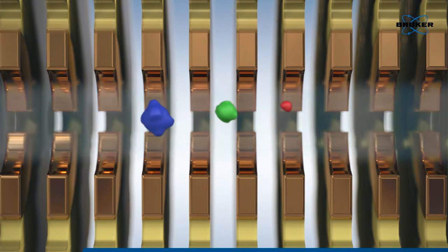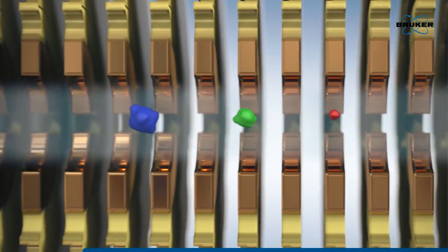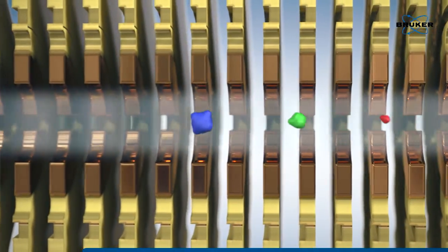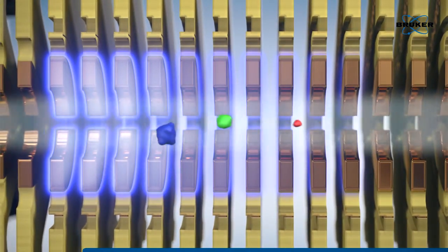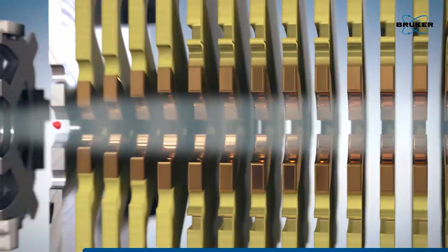In TIMS, a gas flow pushes the ions forward with a force proportional to their collisional cross-section. At the same time, an electrical field holds back these ions based on their charge. As a result, ions are separated efficiently and can be released by manipulating the electrical field.